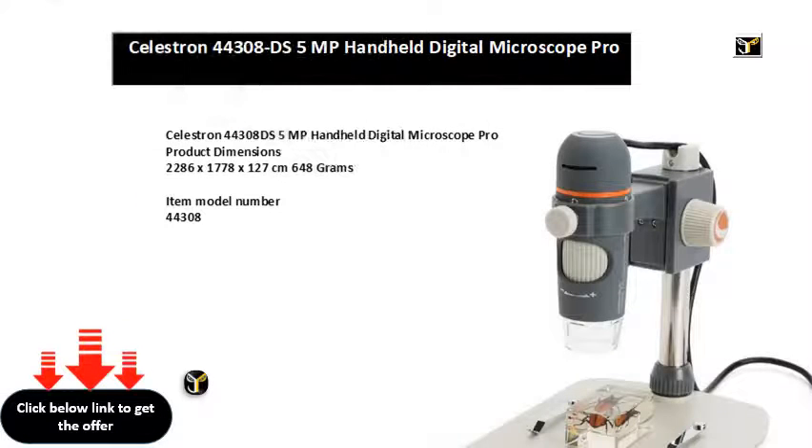Celestron 44308DS 5MP Handheld Digital Microscope Pro. Product dimensions: 22.86 x 17.78 x 12.7 cm, 648 grams. Item model number: 44308. Light source type: LED. Special features include 20x to 200x magnification powers, great for low power observation of 3D specimens. Note: final magnification is determined by monitor size.